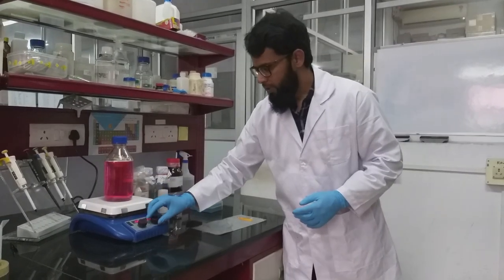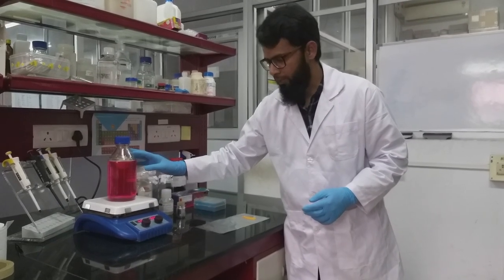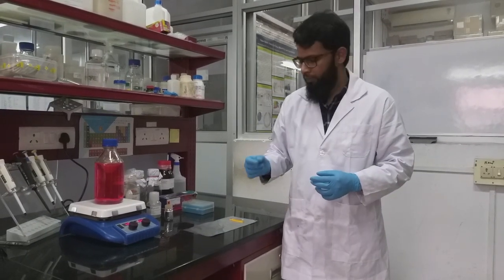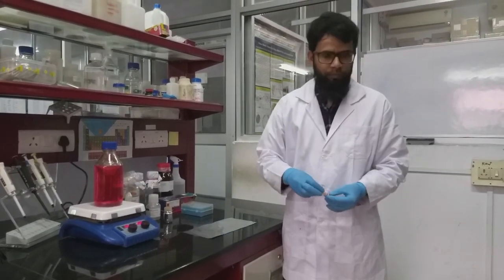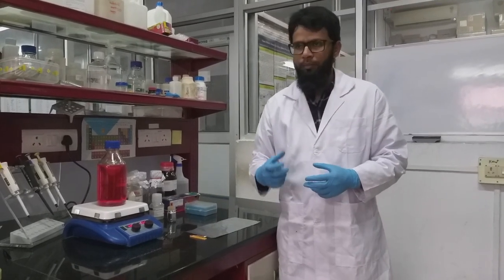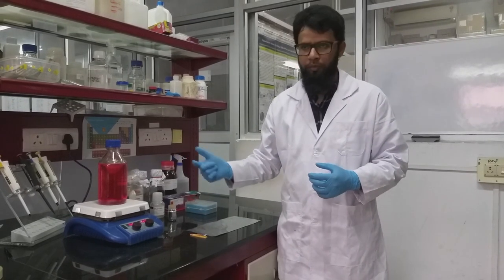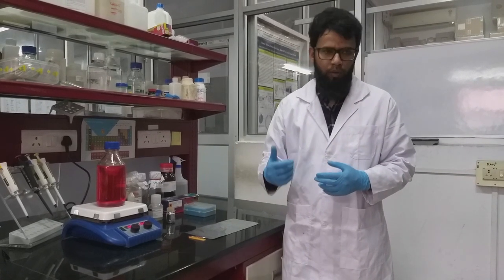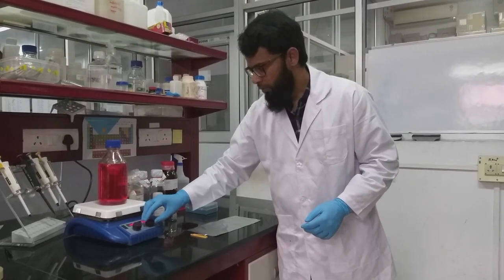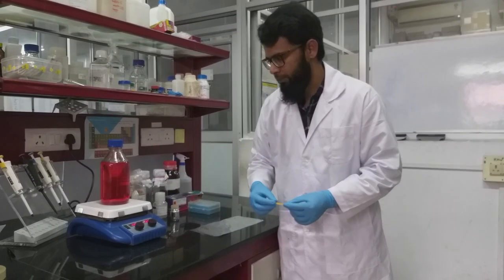After the media components have dissolved completely, we need to set the pH of the media. For that purpose, either we can use pH meter or pH strips. In this case, we cannot use pH meter, as the bulb of the pH meter is sensitive to the media components and may get corroded.